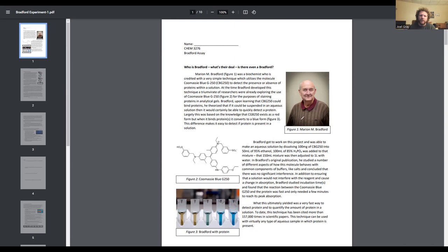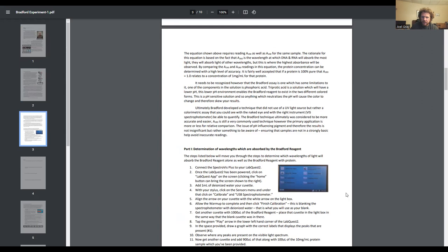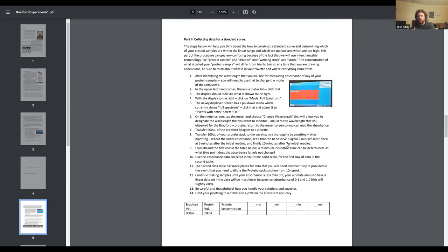And so with that, you're going to again do a full spectrum read, so you should see the same wavelength range, approximately 400-ish to 700-ish. Our initial peaks look like this when we had no protein present. But now when we add protein to this mixture, some of those wavelengths are going to change. There's going to be a new wavelength that absorbs the most. So you will need to figure out which wavelength has the highest absorbance. That will be the wavelength you need for part two, and part two is the actual preparation of the standard curve.